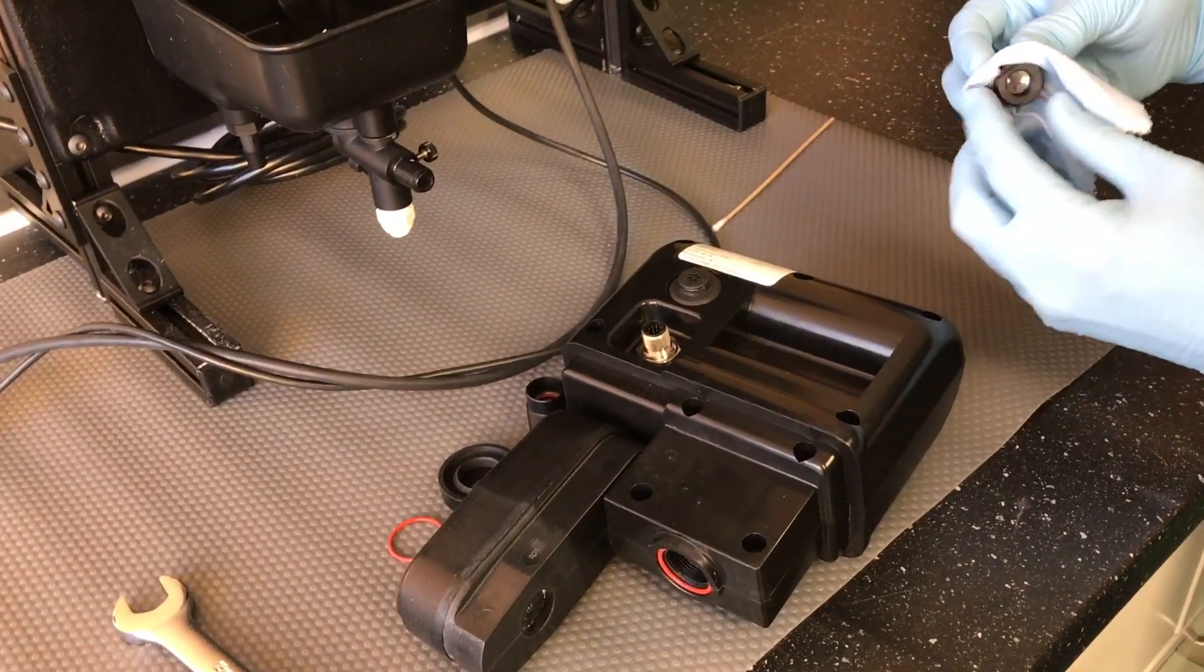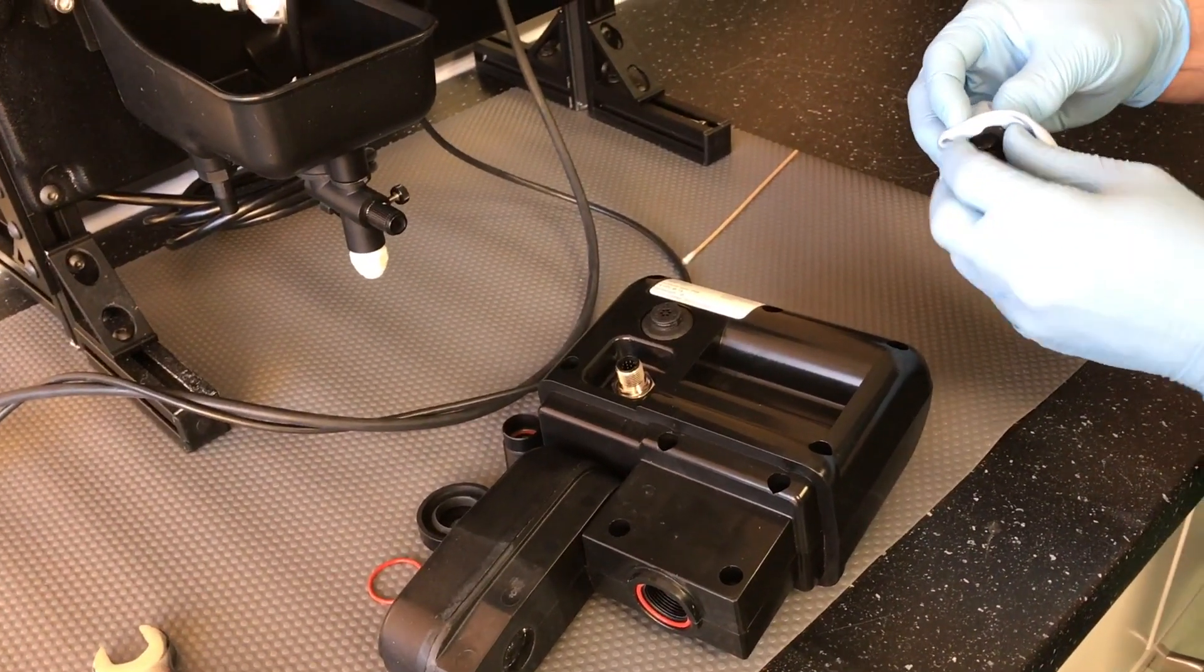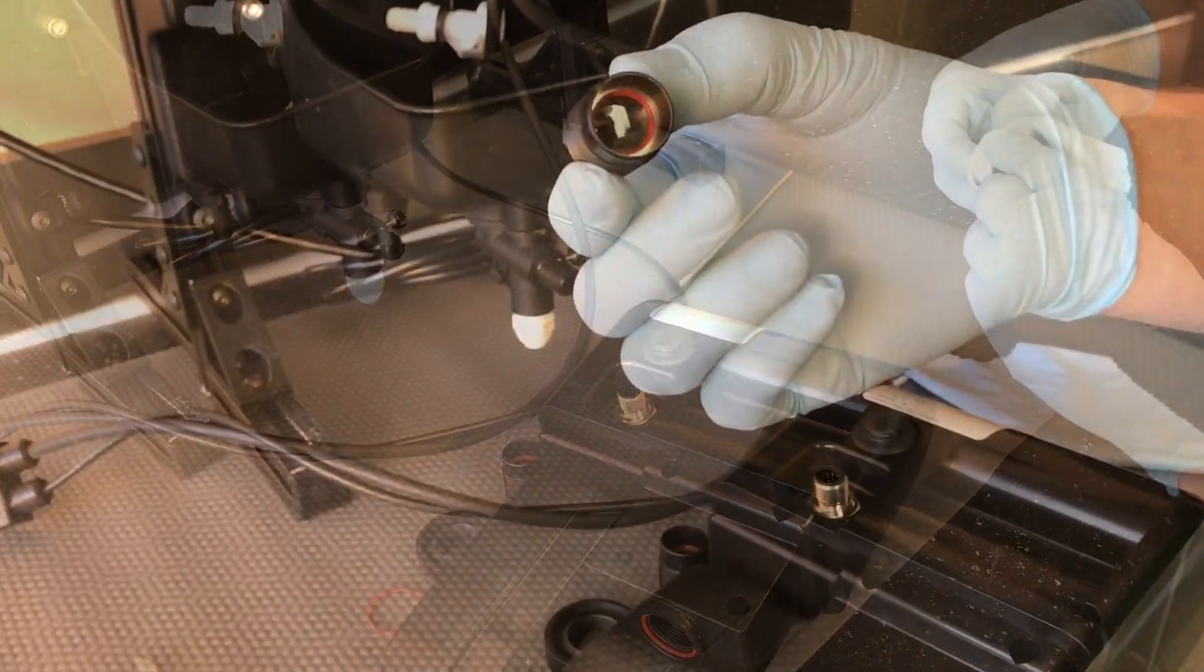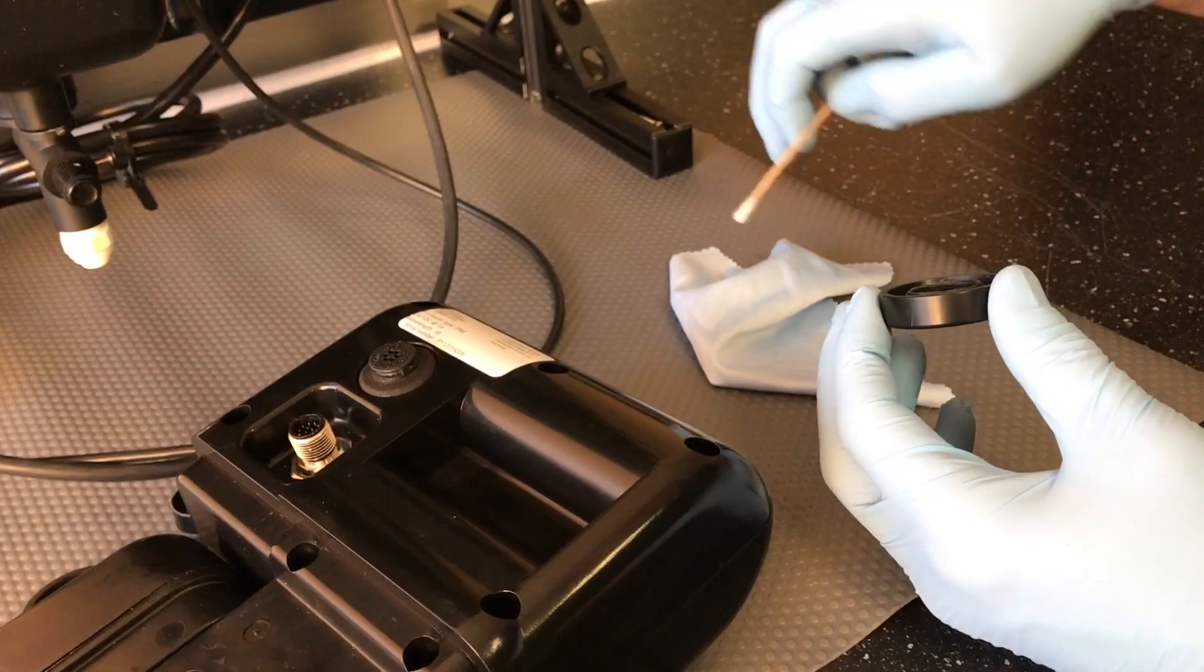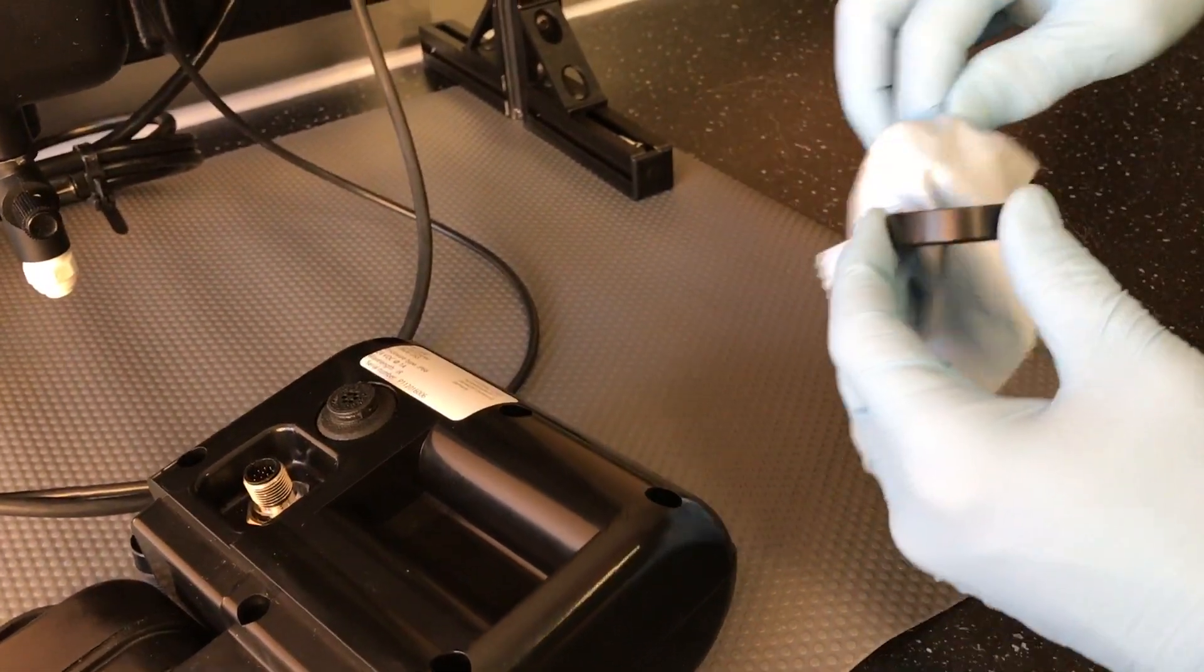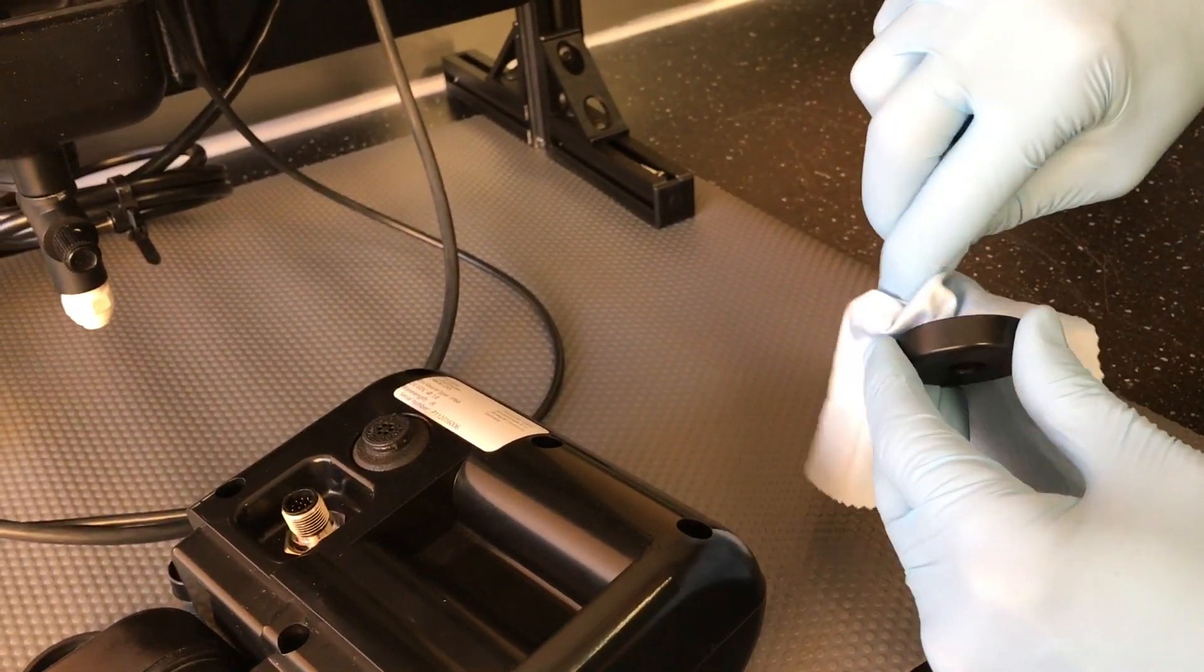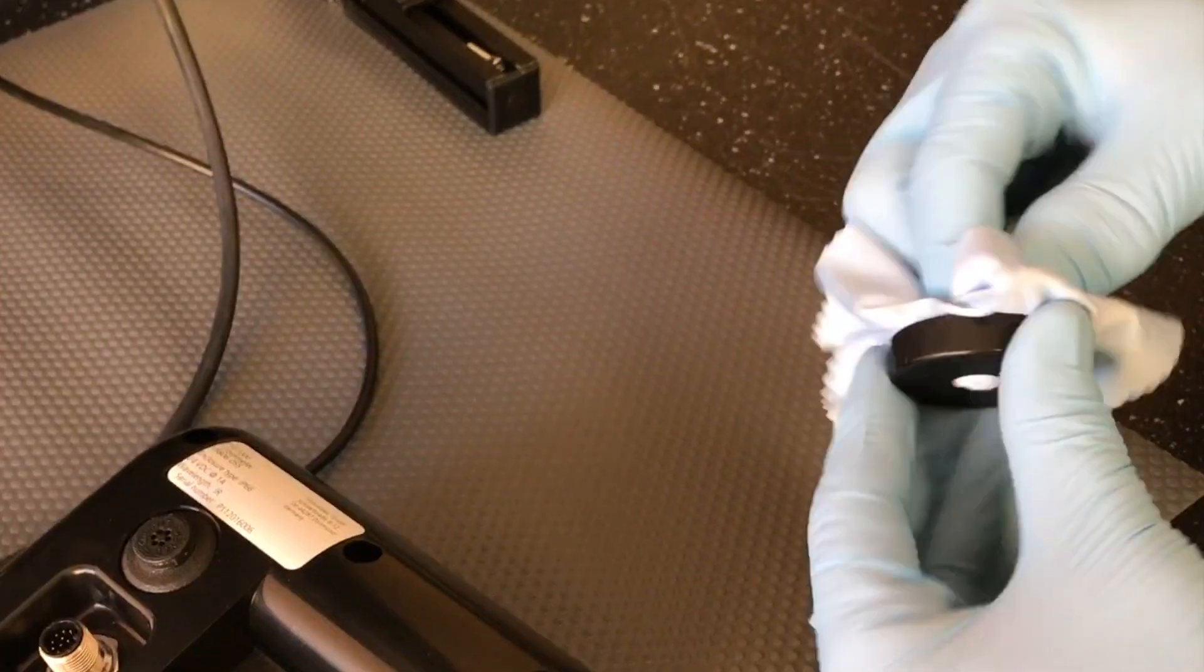Clean the outside surfaces and threads until there is no debris remaining. Clean all surfaces of the cover cap until there is no debris remaining.